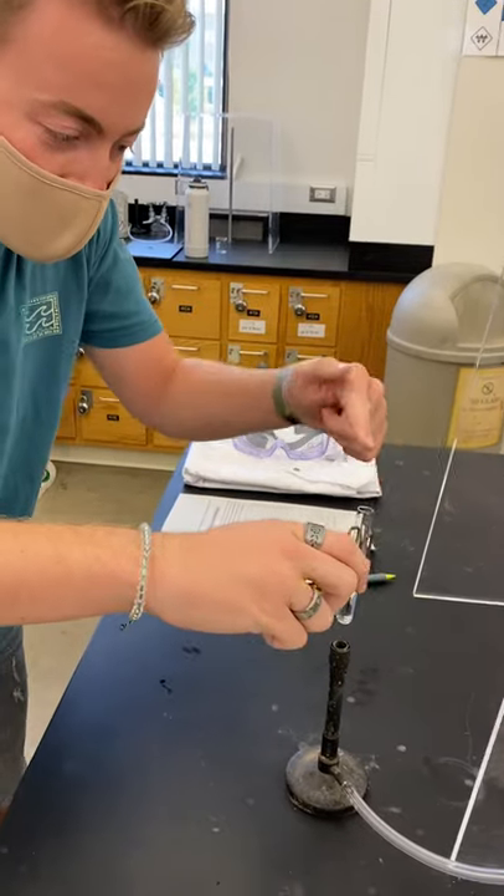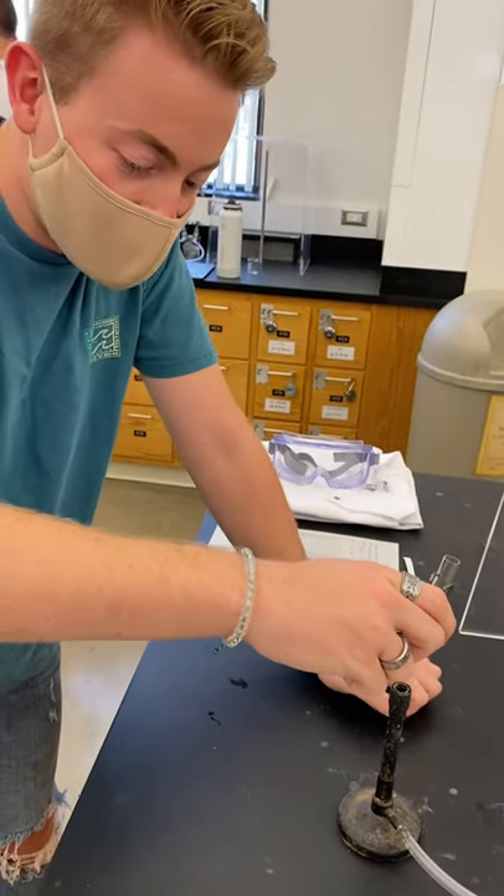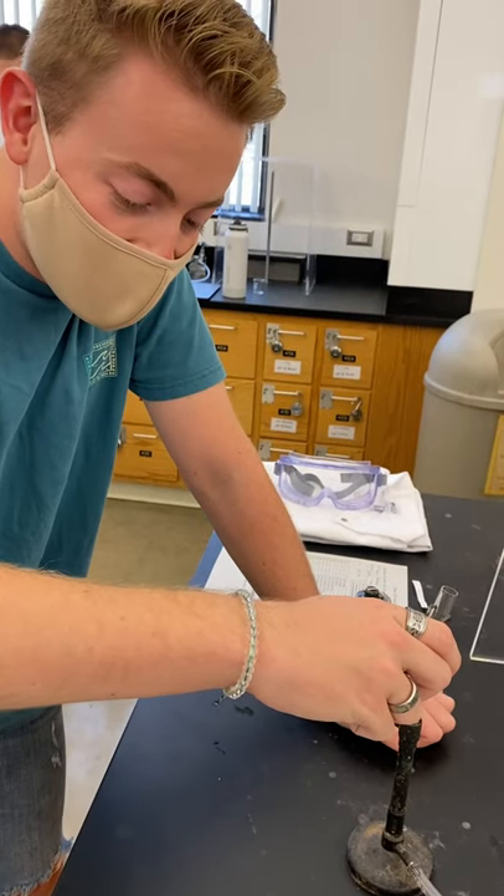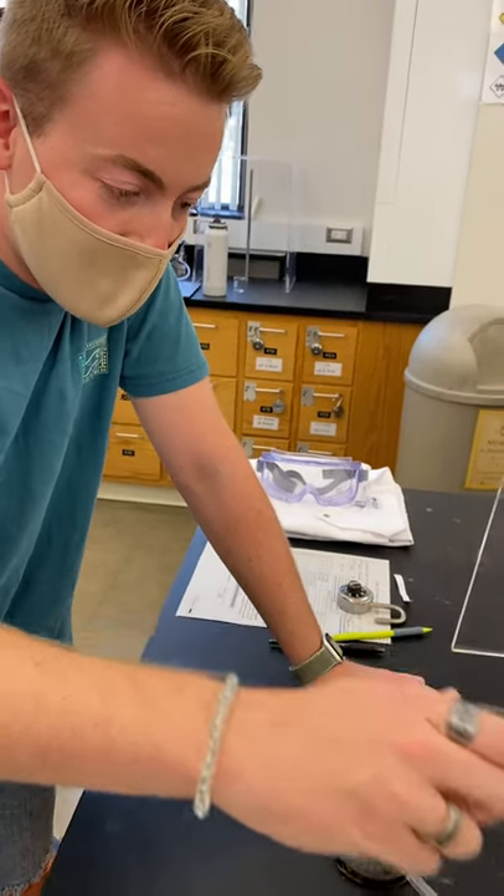Ensure that the opening of the test tube is pointing away from people, in case the chemical suddenly shoots out from the test tube. And place the hot test tube in a test tube rack to cool before touching.